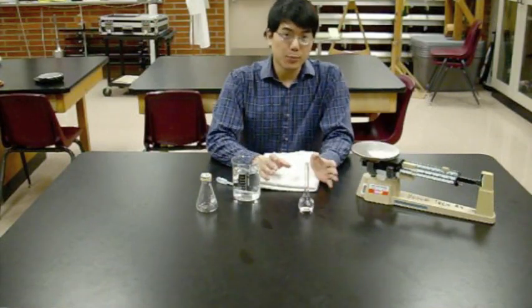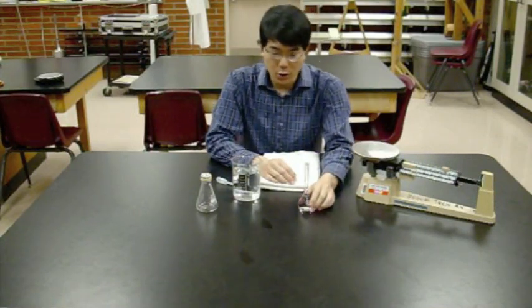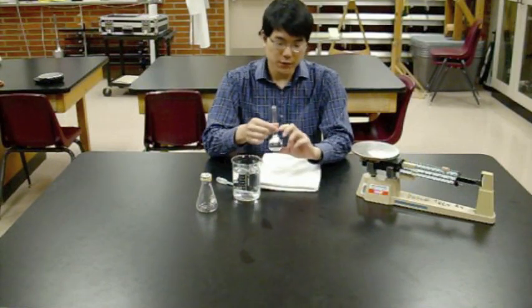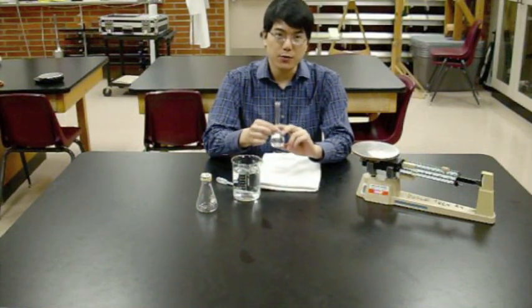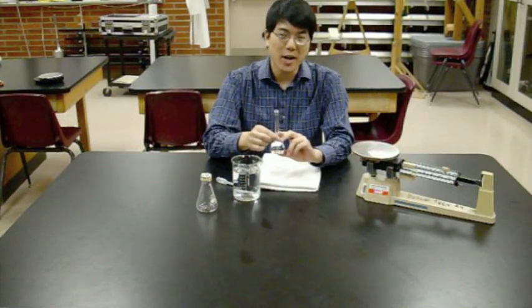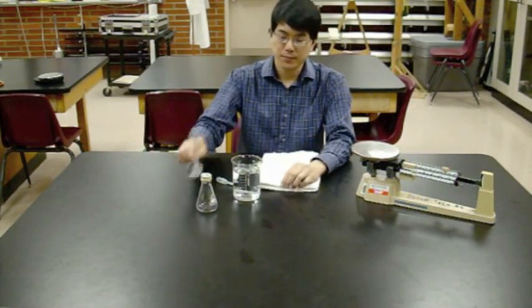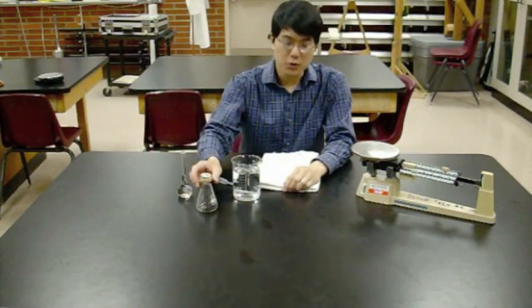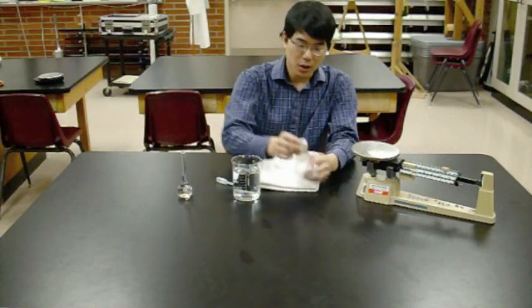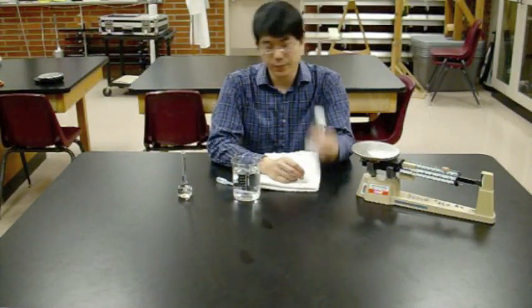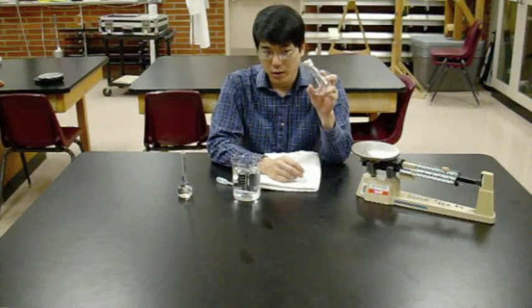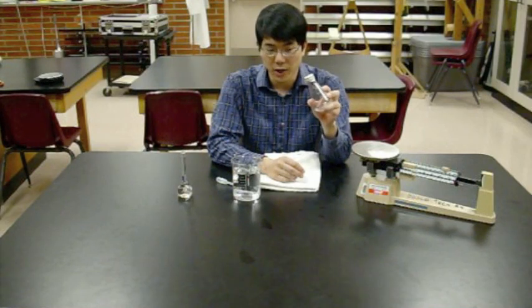Now, that's all a part two. You know the mass of this water. You know that its volume is 50 milliliters. Knowing the mass and knowing the volume, you can calculate density quite easily. Part three of the lab involves doing something very similar, except this time you're using your Erlenmeyer flask that you used to call your Dumas tube.